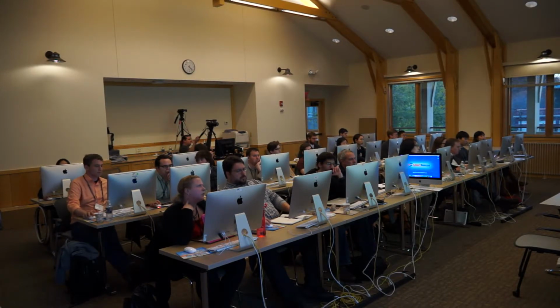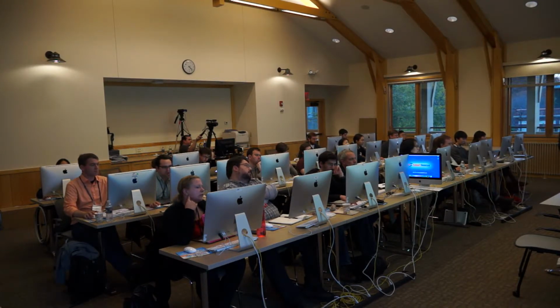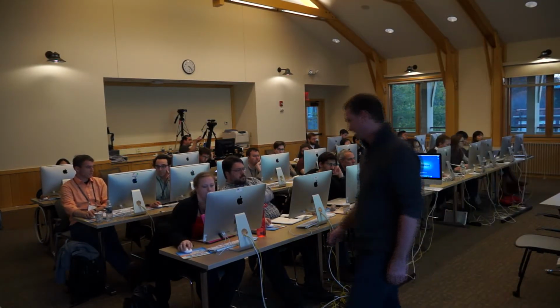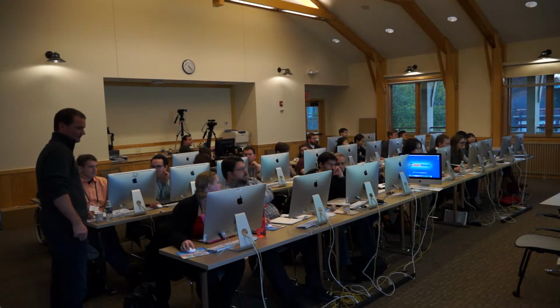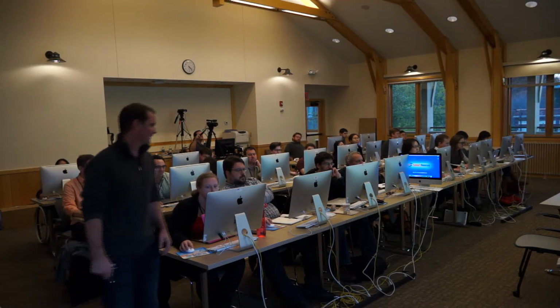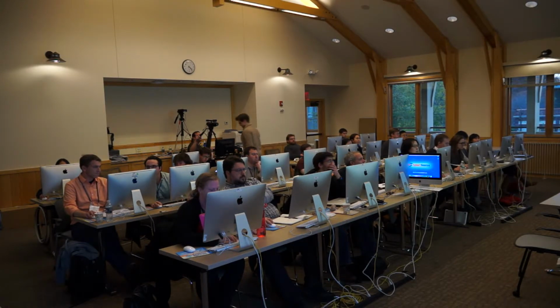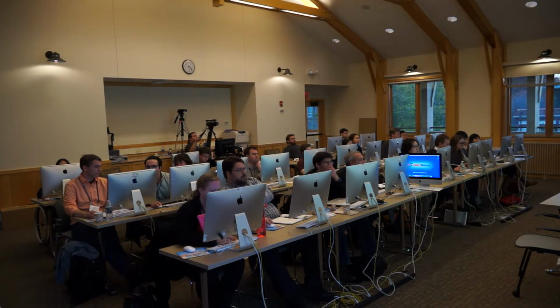So essentially you're looking for a file called SNP-EFF_latest_core.zip. Oh, it just opened it up? Okay. So I guess some people's browsers automatically unpack the zip when you download it. If that happened, and I think that'll probably happen reproducibly for everybody, what you want to do is move that SNP-EFF folder to your desktop.